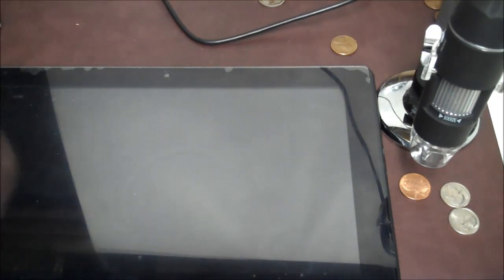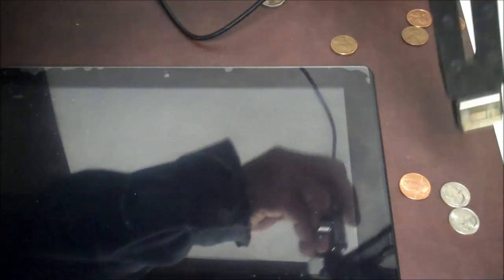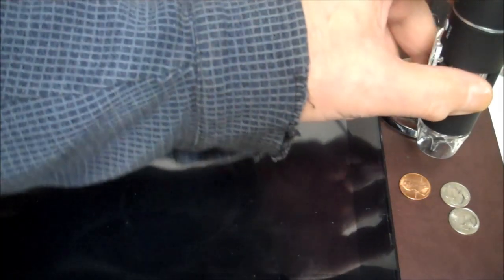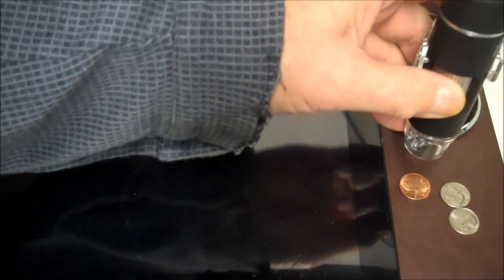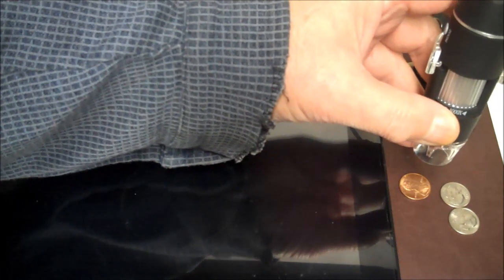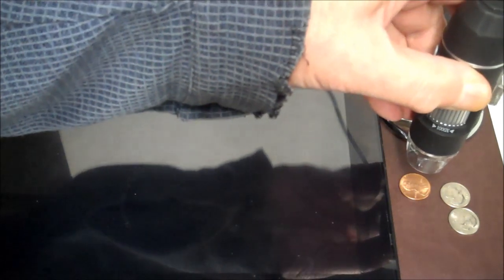Another thing is, this is basically a regular webcam with a little trick they use to focus it. It's like a little pointy thing inside there. So it just focuses on a certain spot and you could zoom in manually here, but mainly to zoom in, you got to bring it real close down almost, almost to touching. If you bring it back up, you're going to get a nice zoom, but it's just really just like a webcam.